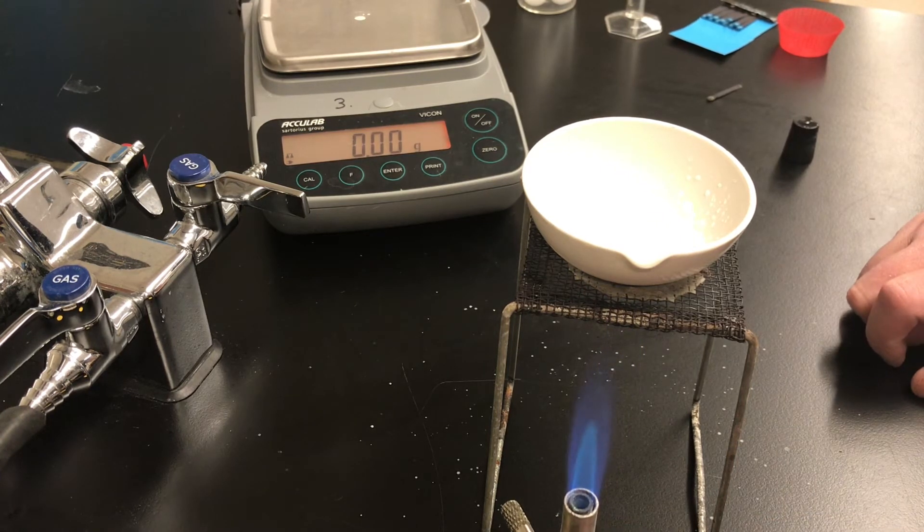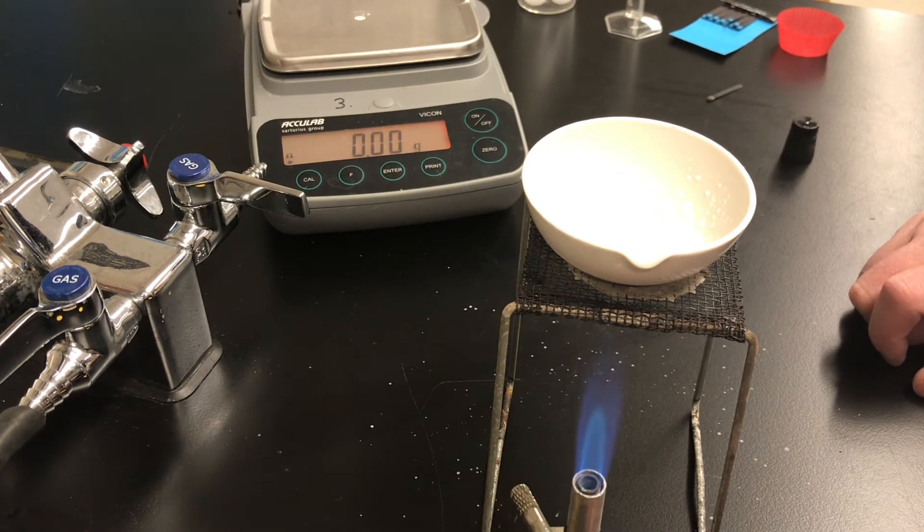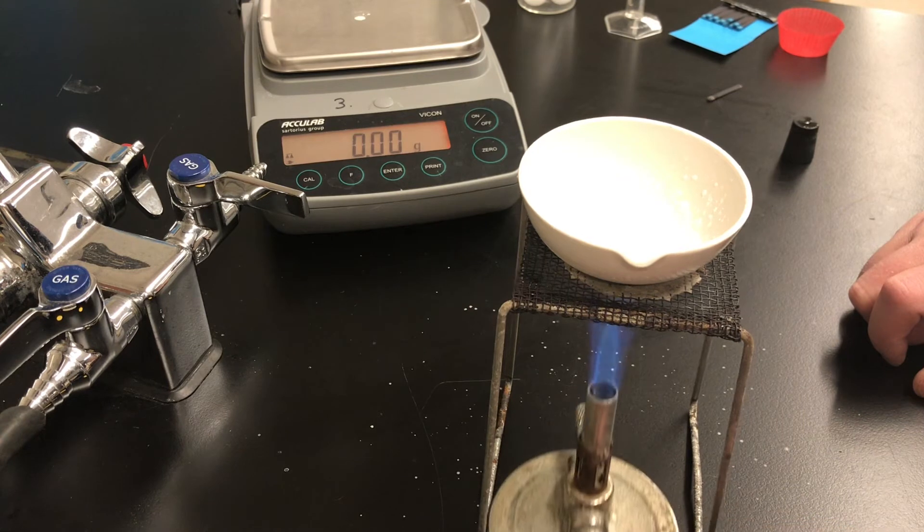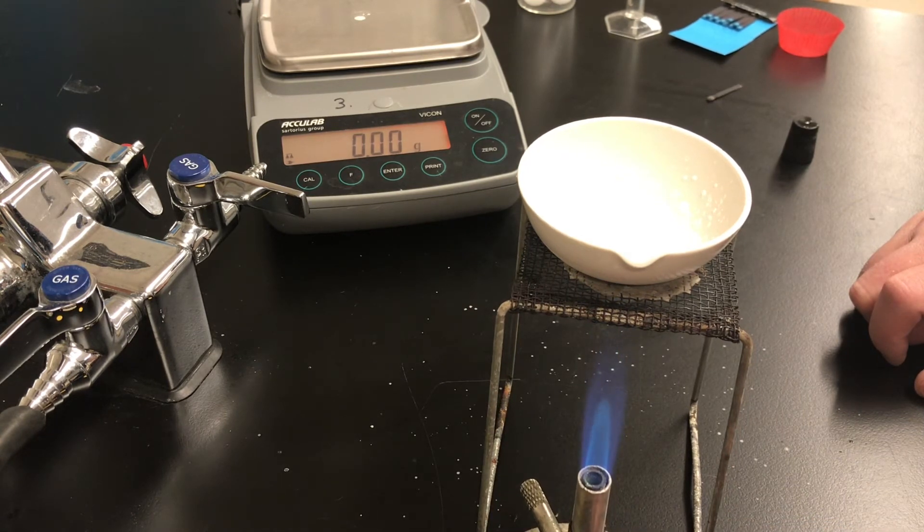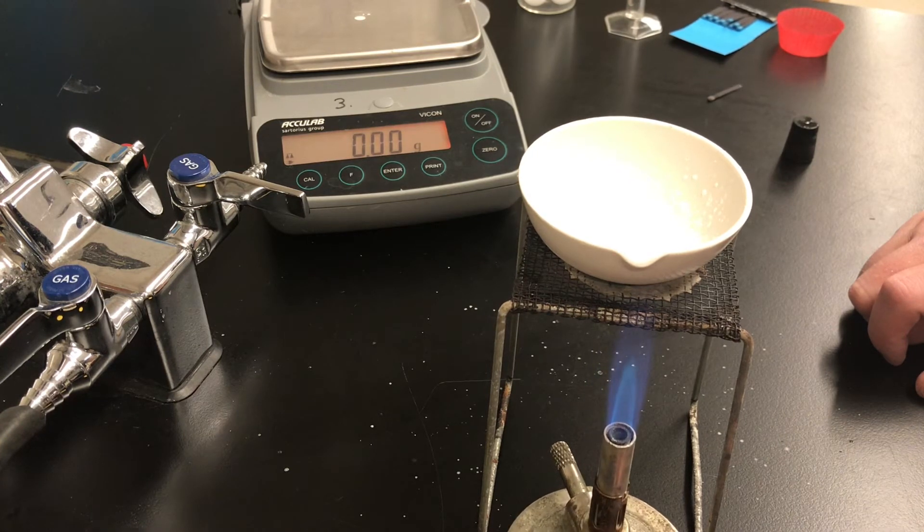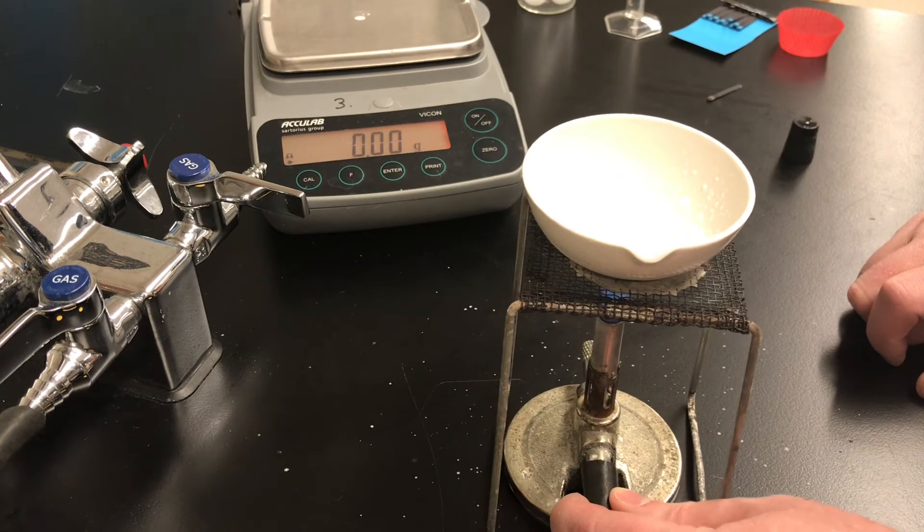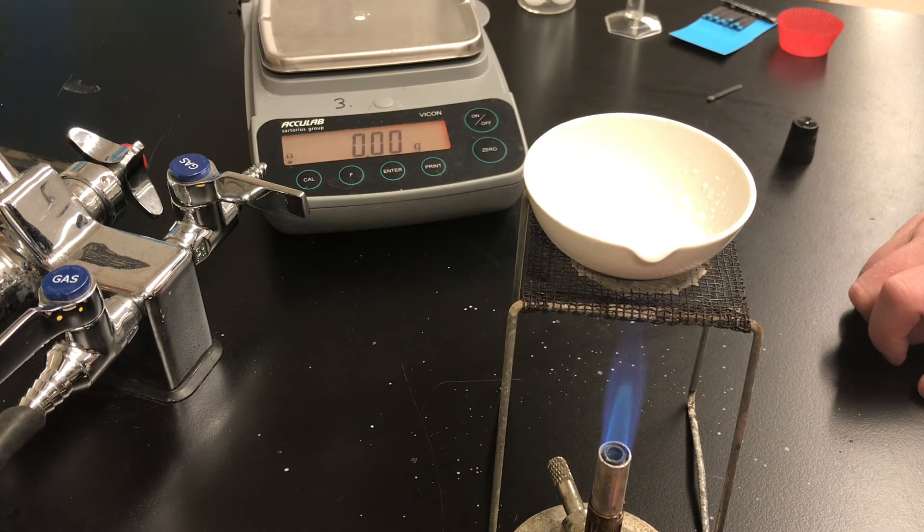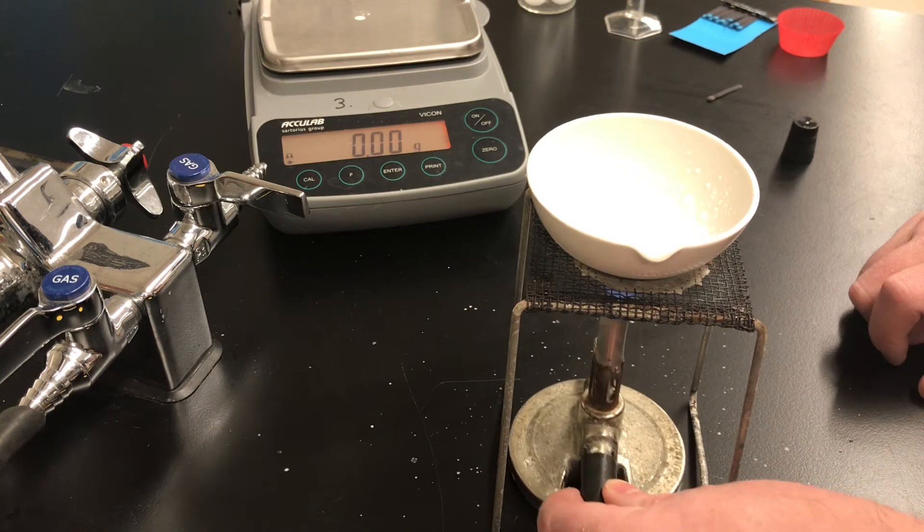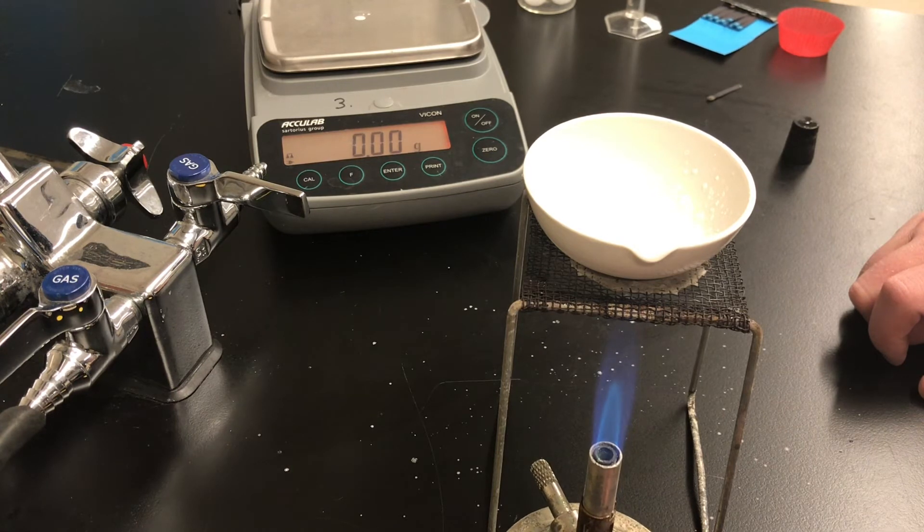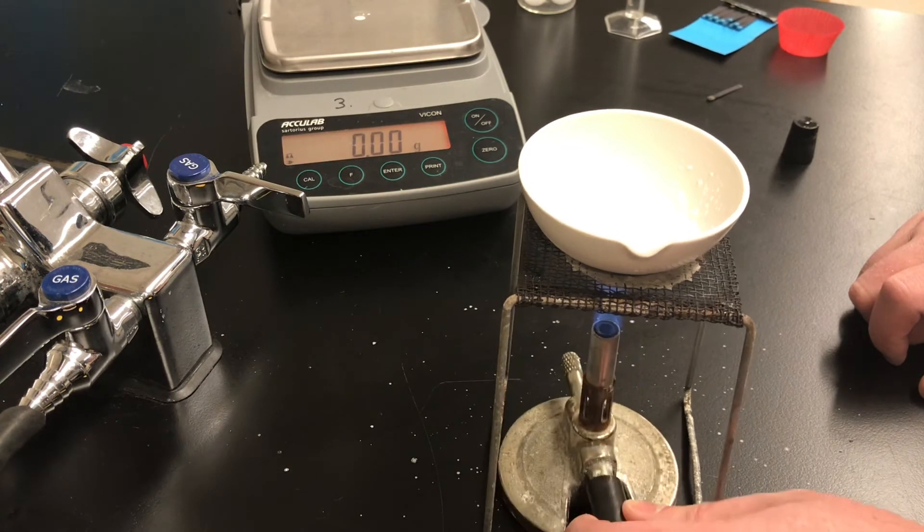We're going to measure in a moment the mass of the dish with the dry salt in it. You'll be able to calculate then how many grams of salt were in that saturated solution. If you look down below in your data table to the results section you can already calculate the first thing you see there. You had measured the mass of the empty dish and the mass of the dish with the saturated solution. You can use those two numbers to calculate the mass of your saturated solution.